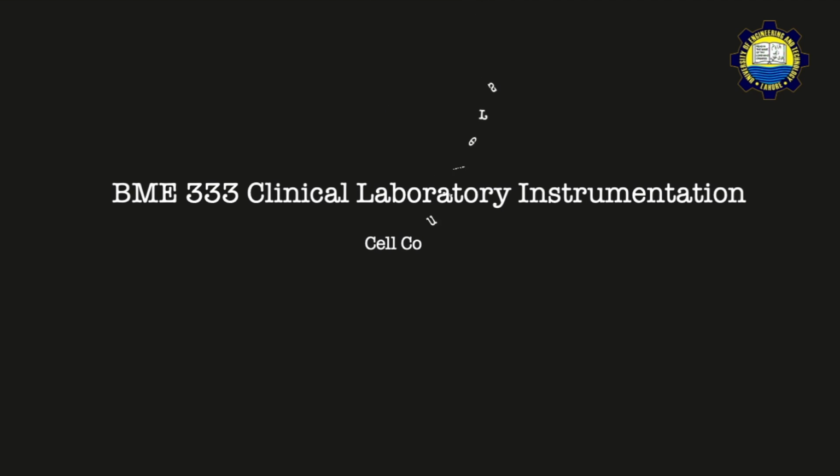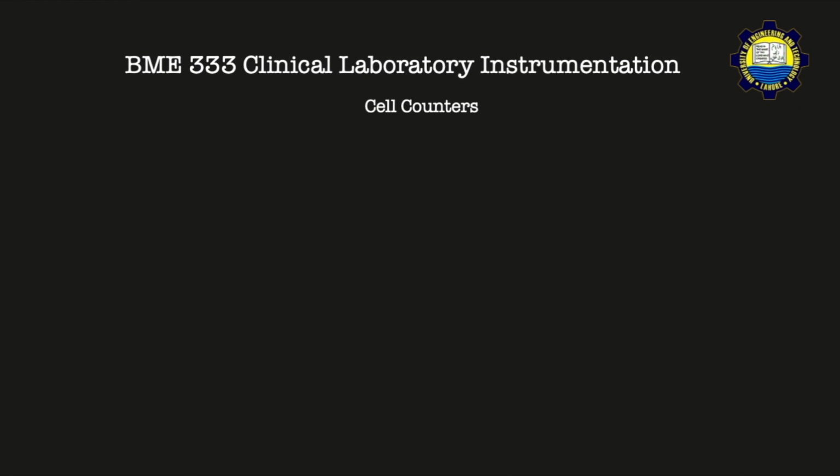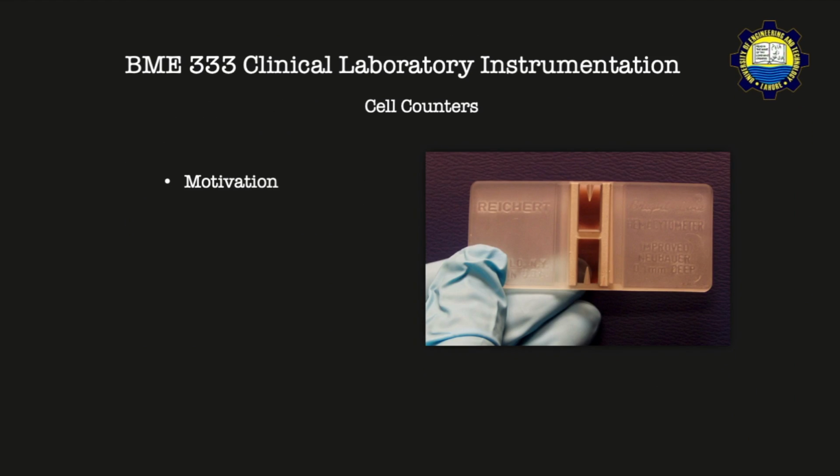What we are interested in today are cell counters. We're going to structure our talk today with some motivation behind why we're interested in these cell counters. Then we're going to look at one specific type of cell counters called hemocytometers. We'll understand what hemocytometers are, when did they come into being, how did they function, especially the process of counting these cells using hemocytometers. We're going to look at some examples regarding that as well.